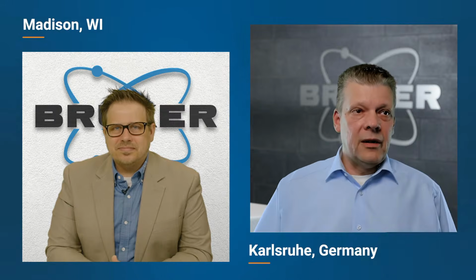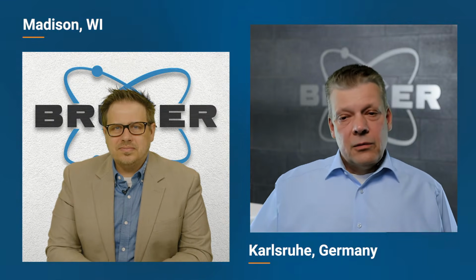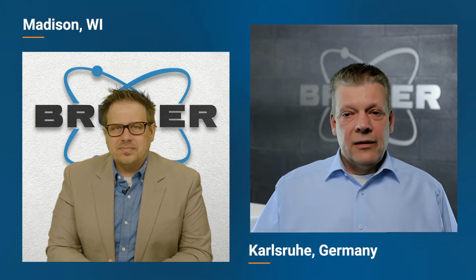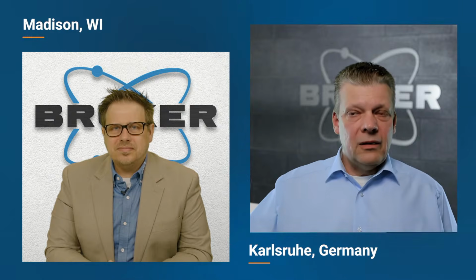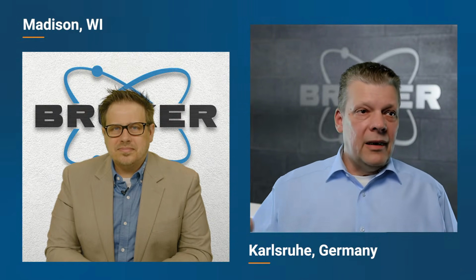If you compare to XRF, where you have only a few lines, here in OES you have way more. And the other difference compared to XRF is that OES is dealing with the outer valence electrons of the atoms, not with the inner ones. And we usually do not create ions.